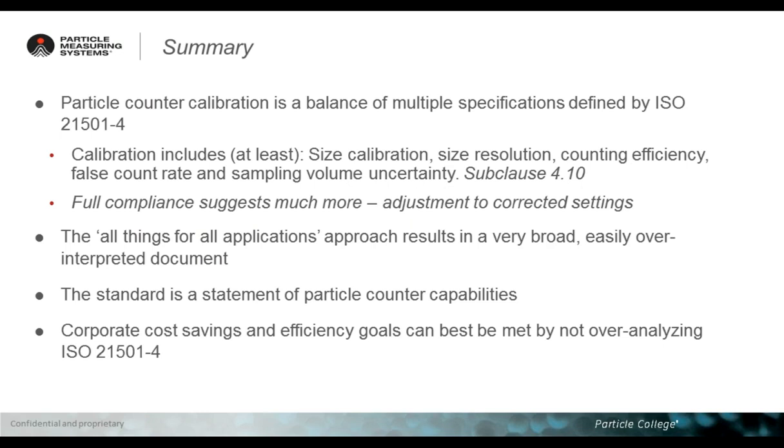So we are now at the end of the presentation, and we will then go to the question and answer session. Just to recall what we discussed today, particle counter calibration is a balance of multiple specifications defined by the ISO 21501.